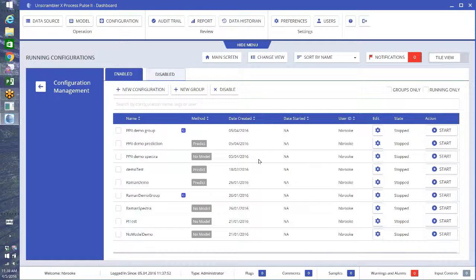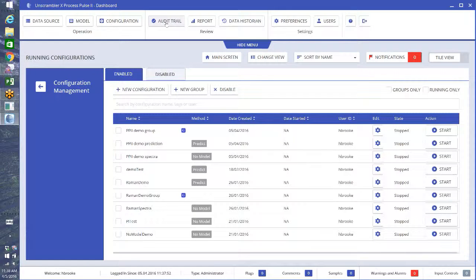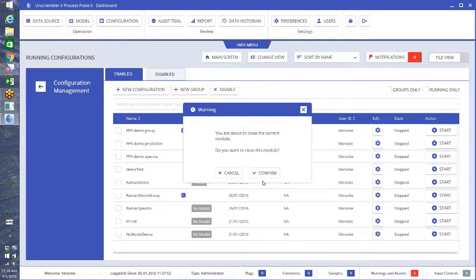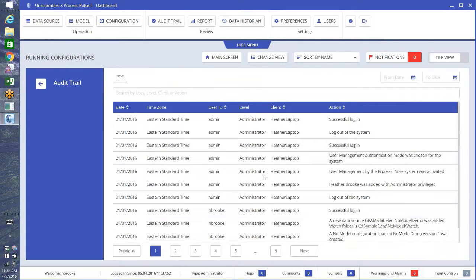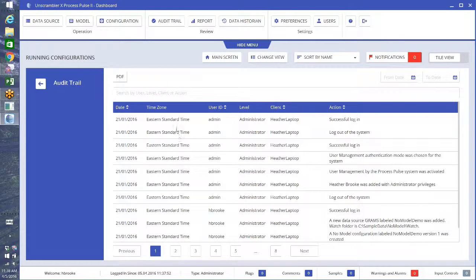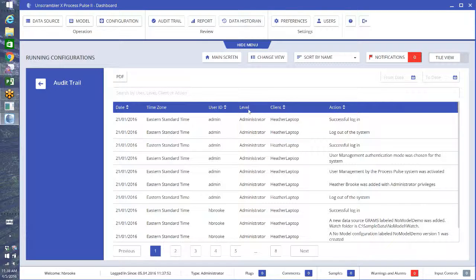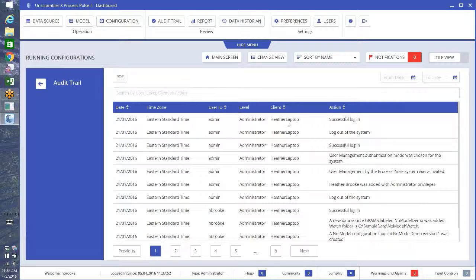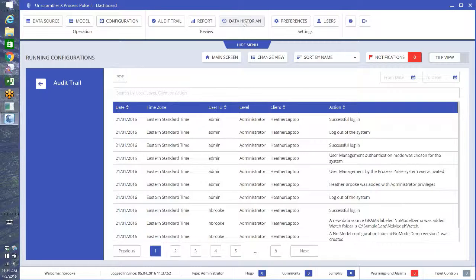There's also an audit trail, so you can click here and see everything that has been done since you've installed Process Pulse, who did it, the user ID, the level of access they have, where they connected from, and what they did. So this is very important for any FDA regulations. You can also use our data historian.